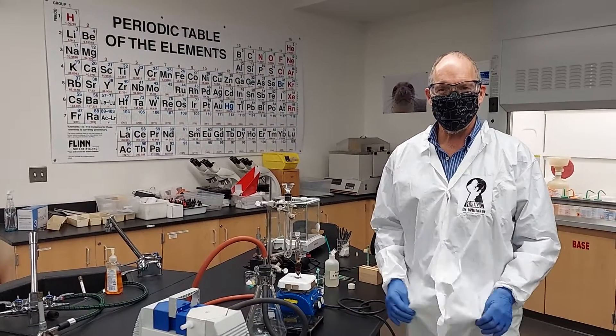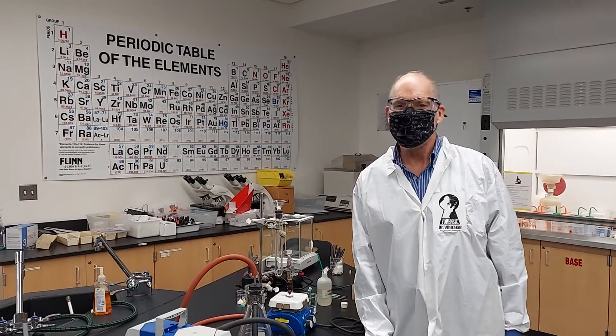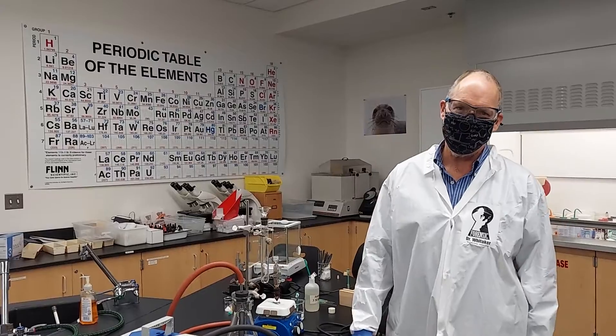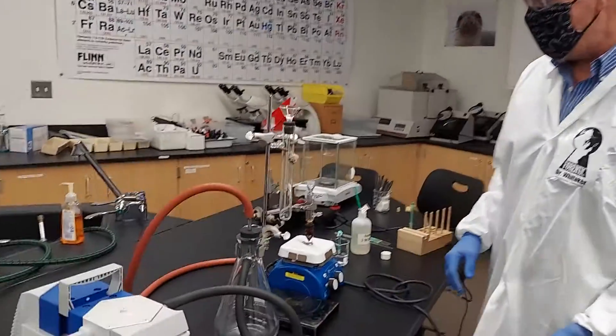You might be wondering why I put my lab coat on. The answer is this is the methyl red lab. A little bit of methyl red goes a long way in permanently staining your clothes, so I want to avoid that if I can.